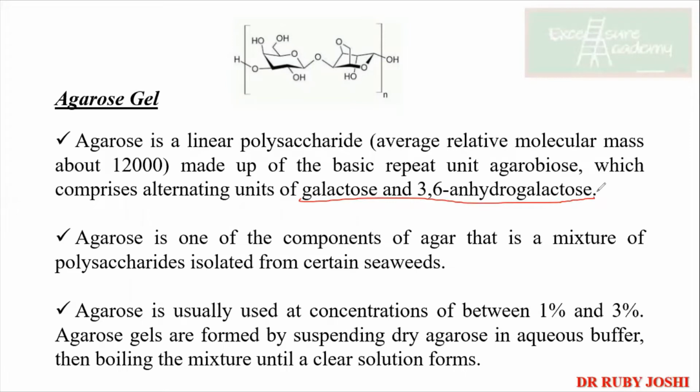Okay. Now they are made from the seaweeds. Any idea कौन सा seaweed होगा? Or do you think in India the seaweed cultivation is there? अगारोस कहाँ से आता है इंडिया में? Yes. Anyone? Have you seen agarose gel? It is like white color gel बनता है. Have you seen? Yes, ma'am. Okay, so you guys have seen.